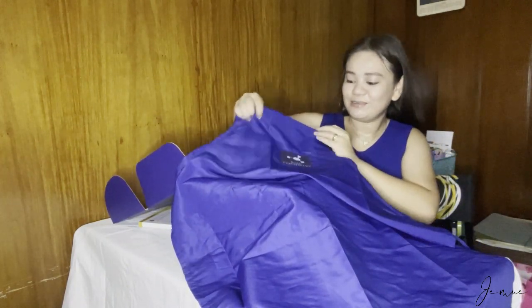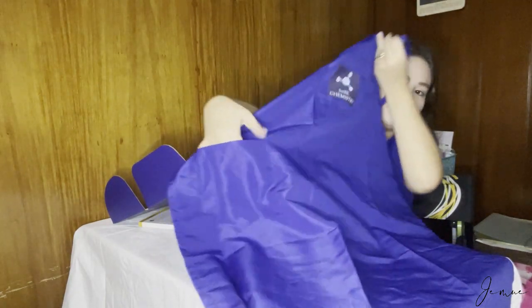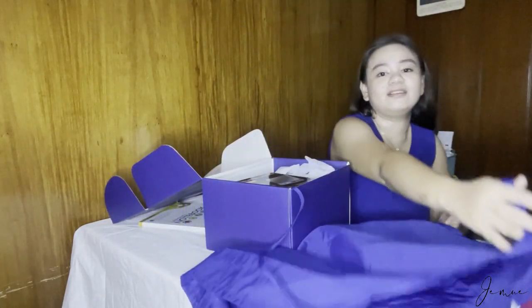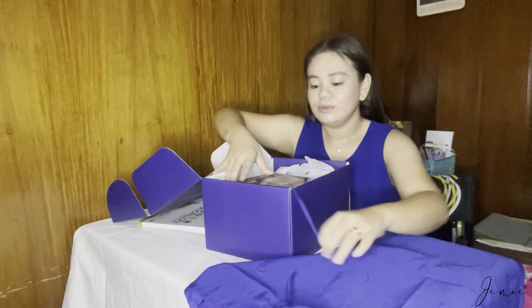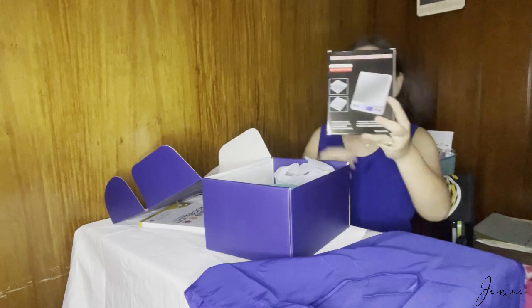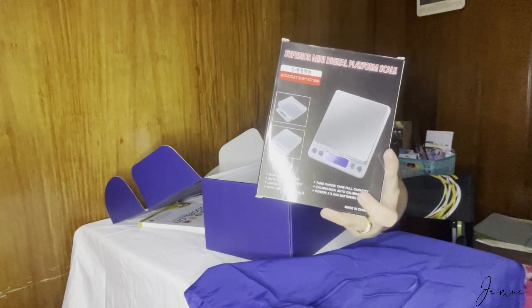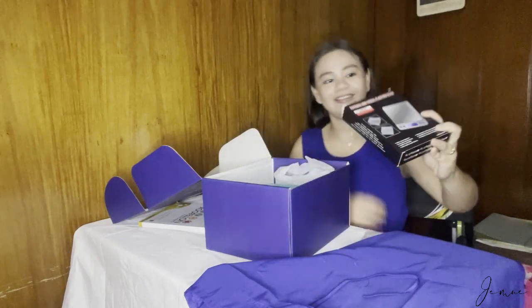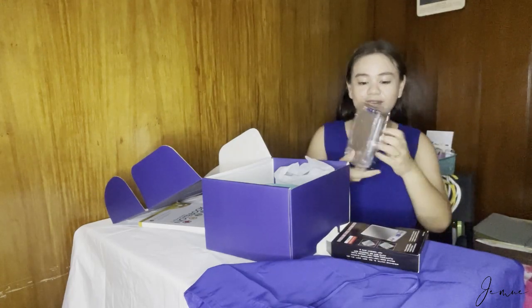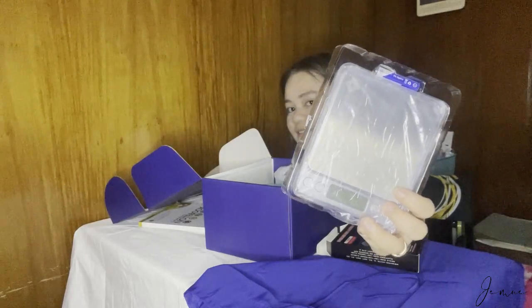So cute! May pocket siya sa itaas, and then meron din siya sa right side. Next, we have an electronic mini digital weighing scale — super cute niya, ang liit. May kasama na rin siyang battery.